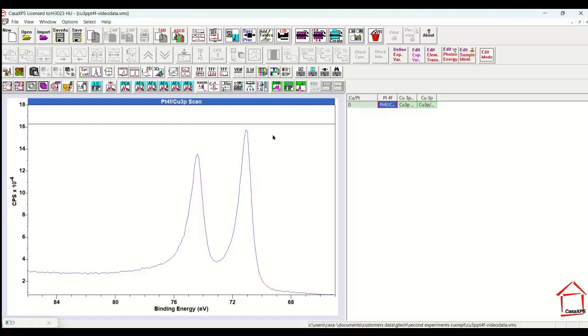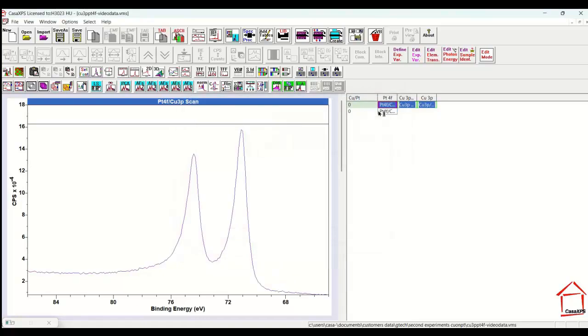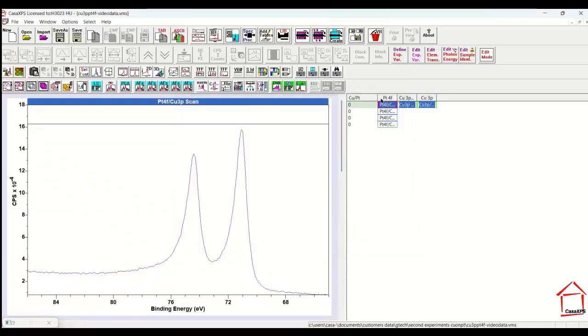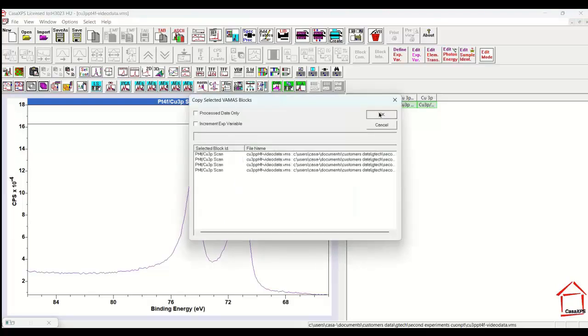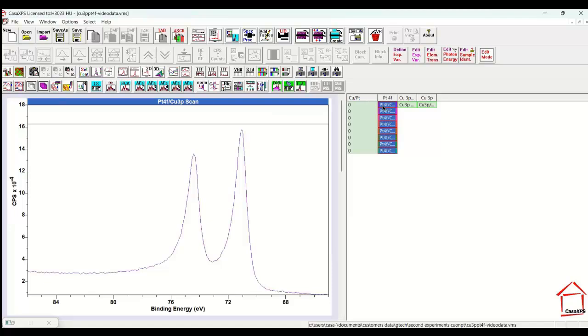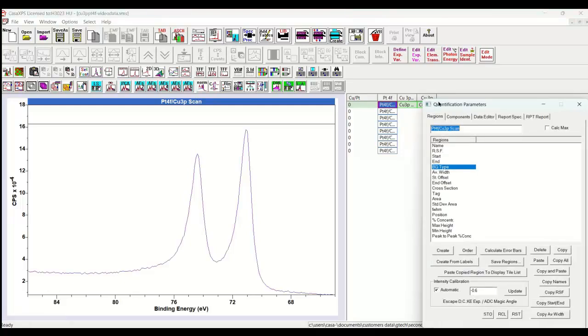The importance of the choice in background will be illustrated using this platinum 4F. I'll make a copy of this platinum 4F several times and then add to each one of these spectra different background types. They're all identical, they all overlay perfectly. But if I choose different background types, then I ought to get different curves that sit below the peak based on the choice of the background.